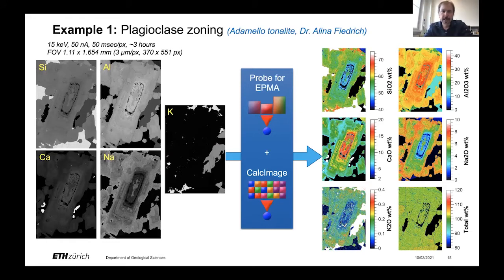Well, you could get maybe the same kind of data by just getting point analyses. But without knowing clearly what the zoning looks like, it might be hard to get representative data of all these different zones in your plagioclase. And plagioclase can have this oscillatory zoning, which renders the point analysis even more difficult.